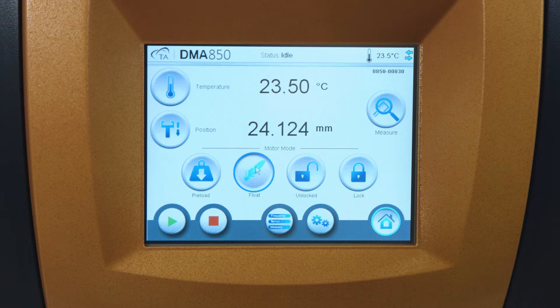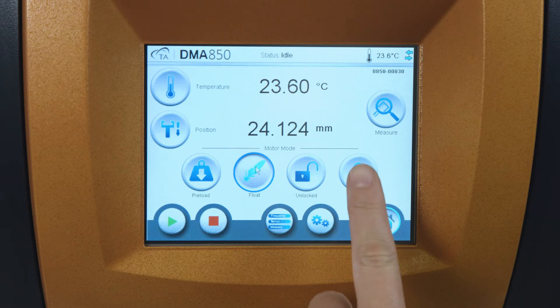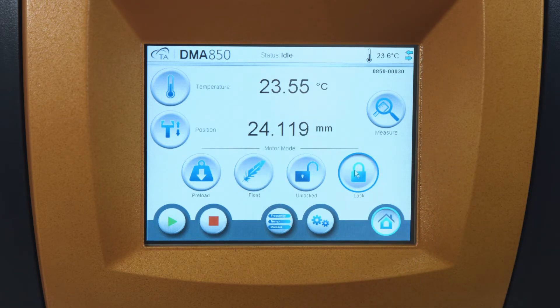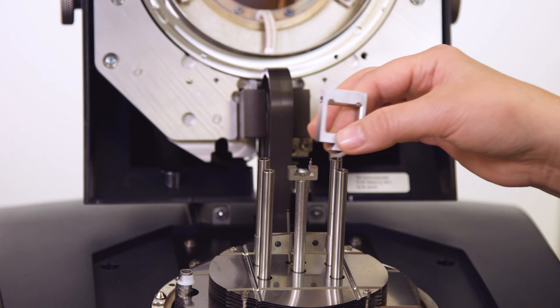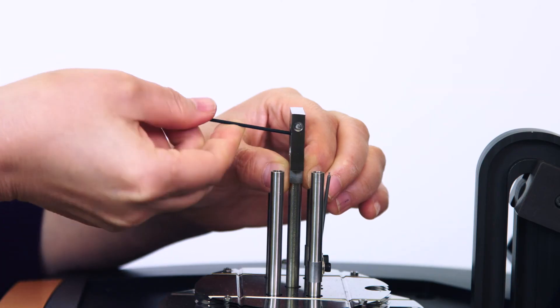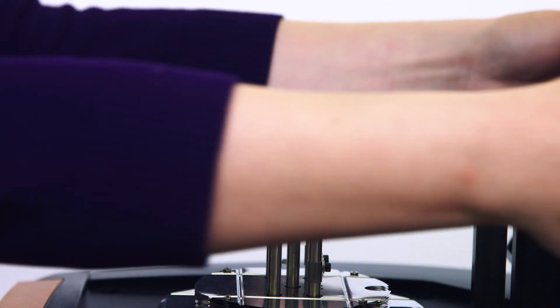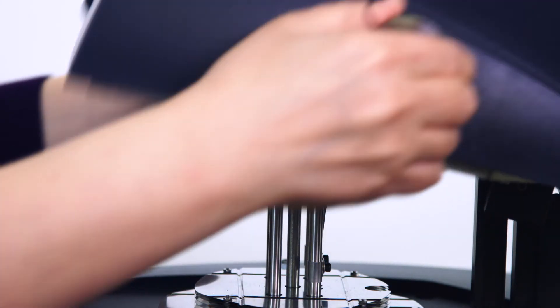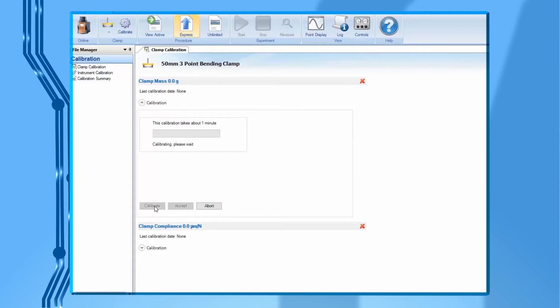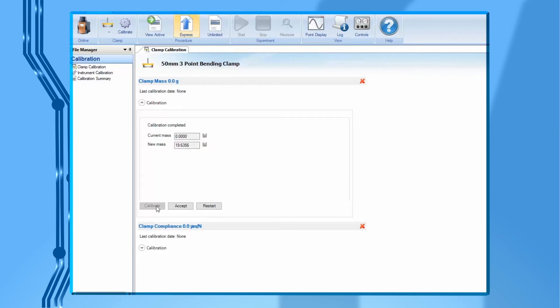From the instrument touch screen, lock the drive shaft. Install the movable clamp to the drive shaft. Then close the furnace. From TRIO software, press calibrate to begin. This calibration is to measure the mass of the movable clamp. After it is finished, click on accept.